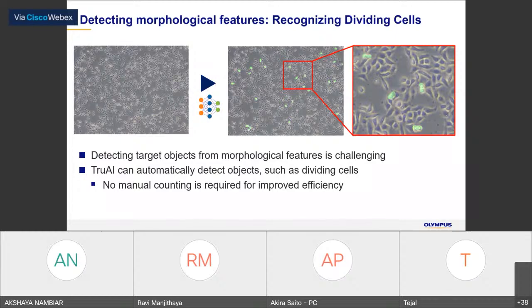Actually, it depends. How can I say? Even if it is low contrast, I will say low contrast, not low intensity, but a low contrast image, if you give the ground truth with that image and create the neural network, it will detect even when the contrast is low.